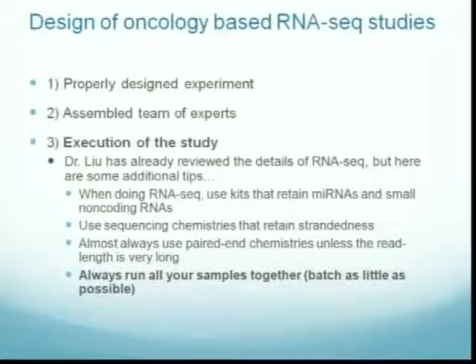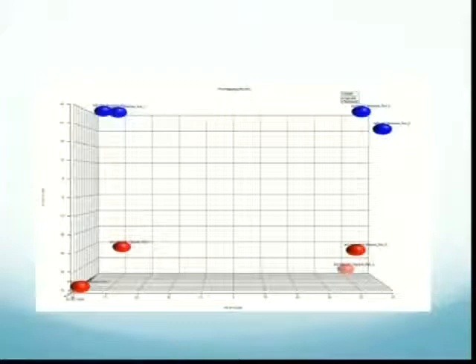And always, always, always, as much as possible, run all your samples together, meaning you want to batch as little as possible. To illustrate that point, I'm going to show this example. This is a recent RNA-seq experiment in a cancer cell line, okay?